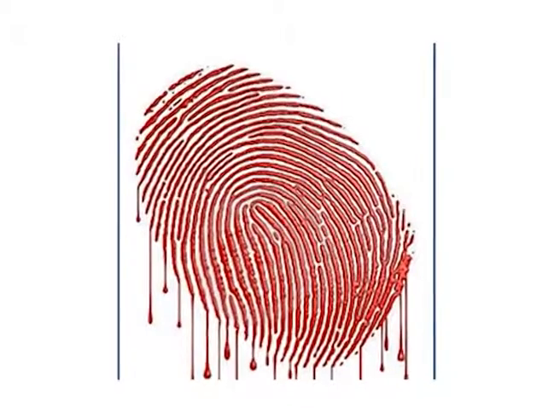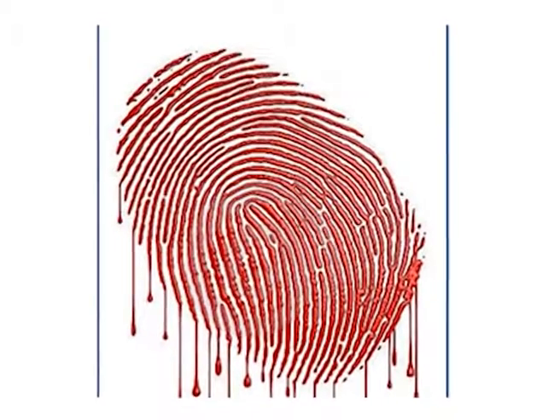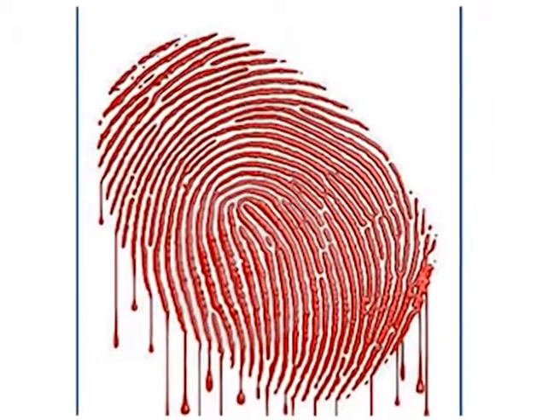On coagulation, the serum content of blood separates out from the cellular content. The blood cells usually form a solid red mass which is surrounded by a layer of straw colored serum fraction. The serum portion is rich in soluble proteins. The blood cell fraction is rich in heme component. There are two broad methods for detecting blood fingerprints.